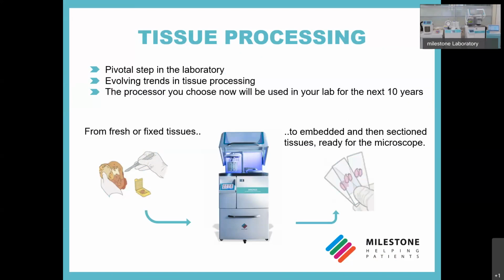Let me stress the importance of the tissue processing procedure. Any mistake in the schedule or in the protocols can result in the production of tissue specimens that cannot be sectioned and therefore will not provide any useful microscopic information. This can be disastrous if you are dealing, for example, with diagnostic human tissue, where the whole specimen has been processed. You will have no spare tissue and therefore no diagnosis for the patient who is waiting for answers.